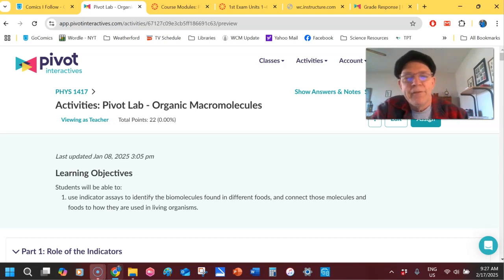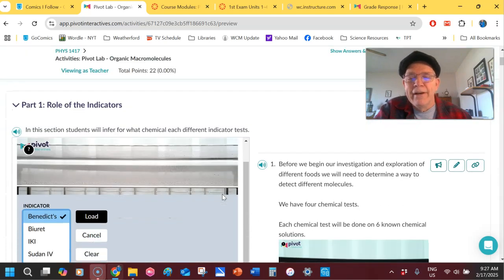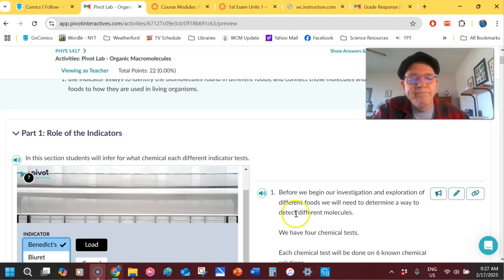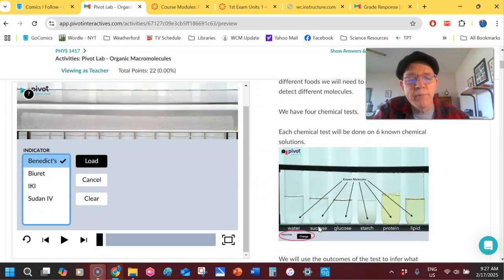All right. This one will take you through some different tests that are used to find if certain ones are present. Some of them are very definite tests, others are a little difficult, especially for people like me who are slightly colorblind. So be patient, and I try to give you a couple of choices so in case you miss one, you can resubmit that.